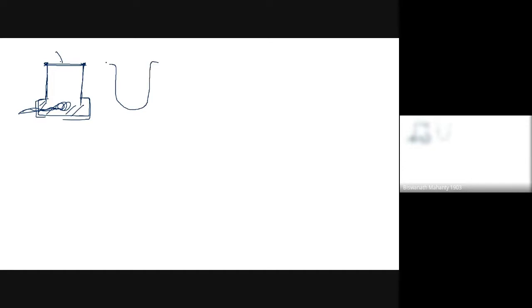And the top plate is only metal. This is a metal plate. Of course, for standing, you can put some stand, that is different. Just for standing purpose, a metal stand is there, but that is not a part of the fermenter. So this is a fermenter, for example. Here, the top plate, and here, a semi-spherical bottom.